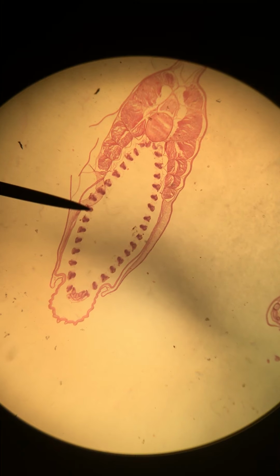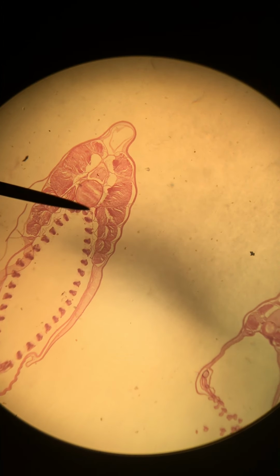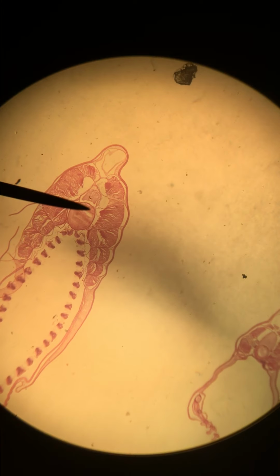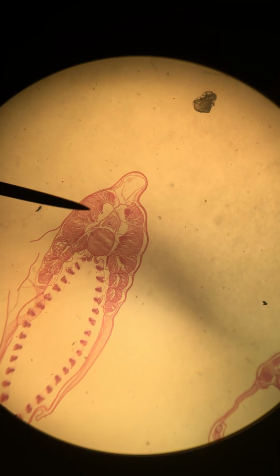Right here, gill bar, gill slit. And if we move along the midline back towards the dorsal side, we still have a nice round notochord, nerve cord, our dorsal fin, and on both sides we've got our myomeres and myosepta. So I think that's it for this one.